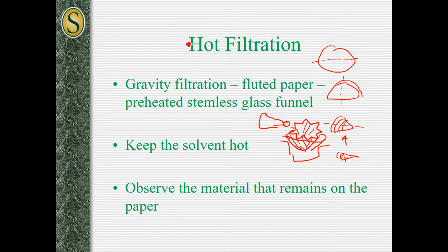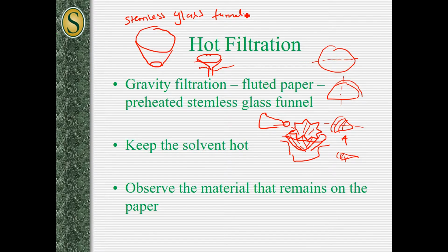All right. So the broken glass funnel is going to be of this shape. So that's your glass funnel. It doesn't have a stem. It's broken there. Normally for a funnel you do have a stem. We intentionally took off that part, so we have a broken stemless glass funnel. You should have it as one of the figures in your notebook. Stemless glass funnel. Alright, so your filter paper will sit on the stemless glass funnel.